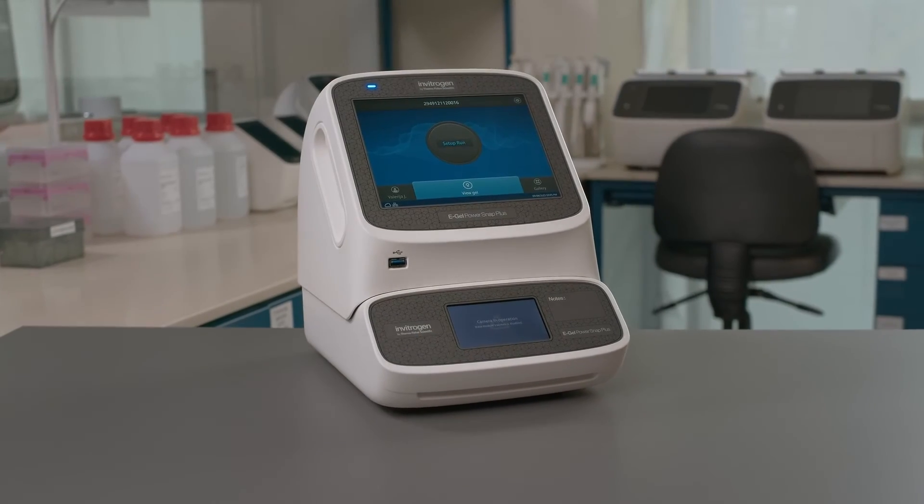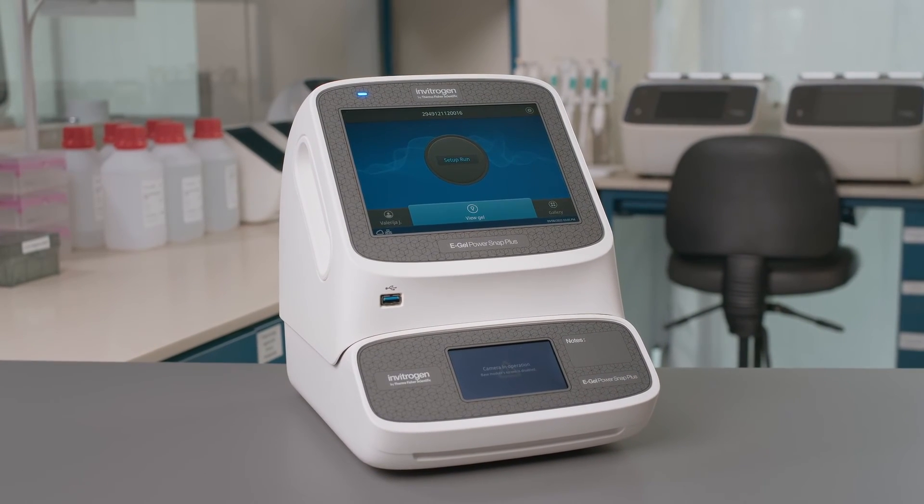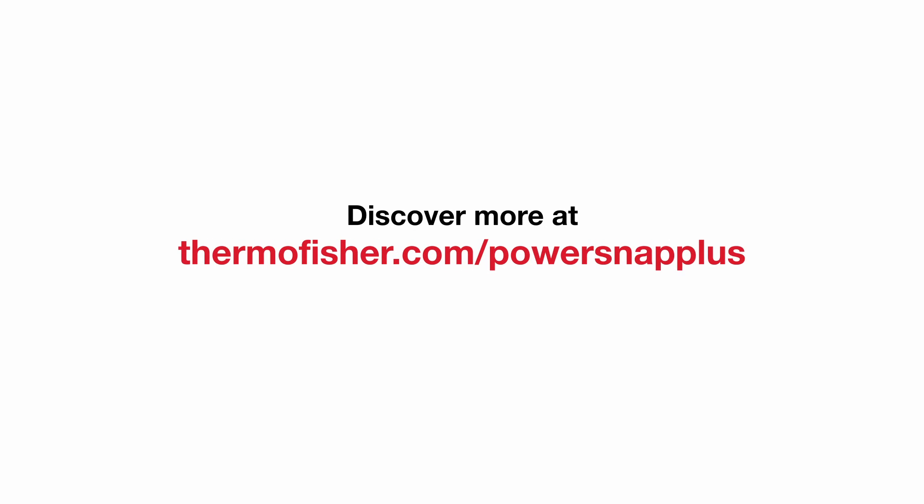The eGel PowerSnap Plus electrophoresis device makes your nucleic acid electrophoresis quick and easy to use. Discover more at ThermoFisher.com/PowerSnap Plus.